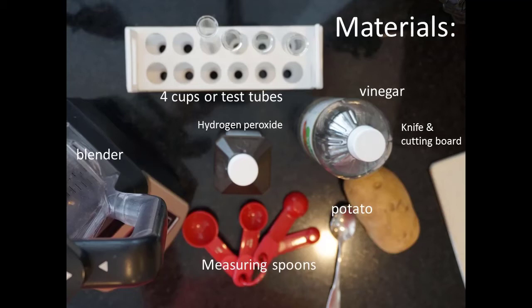Your materials for this week's lab are four cups or test tubes, vinegar, a knife and a cutting board, hydrogen peroxide which you can buy at the grocery store, a potato, measuring spoons, and a blender.